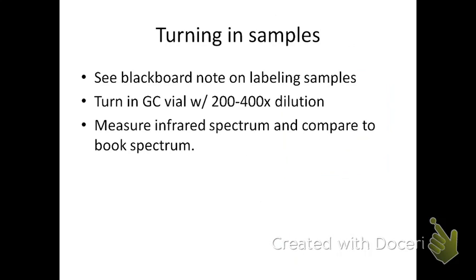At this point, you'll have collected your clean isopentyl acetate into a pre-weighed vial. That's what you'll be transferring to from the Hickman head. You'll weigh the vial again. You'll get the mass of product produced. You'll have to use a percent yield calculation in your notebook to figure out what your percent yield is. And then you're going to turn in your samples.